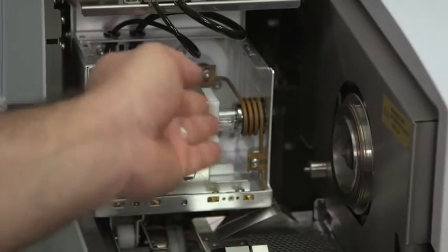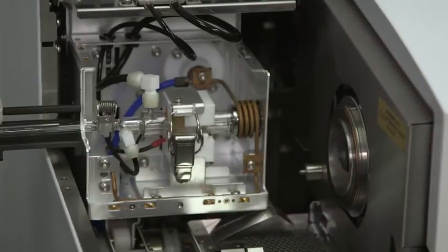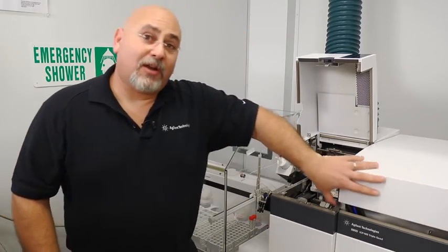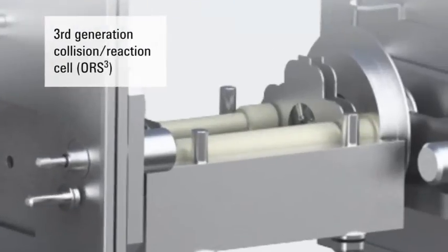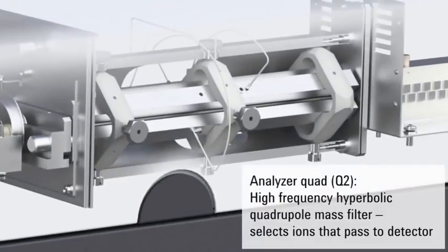After the sample gets ionized, the ions are carried into the high vacuum region, where in the Agilent 8800 Triple Quad we have a quadrupole, the octopole reaction system, and then the second quadrupole, hence allowing for MS/MS capabilities.